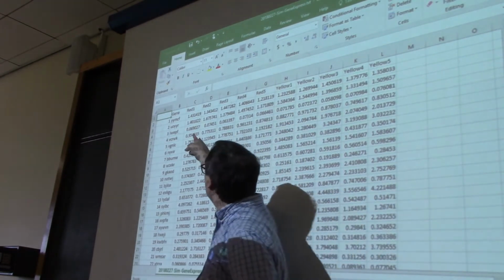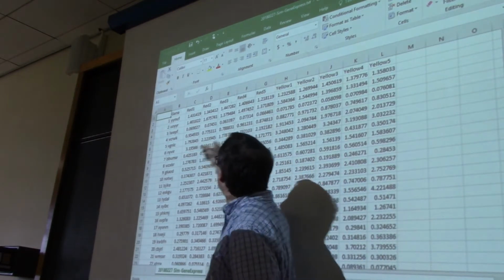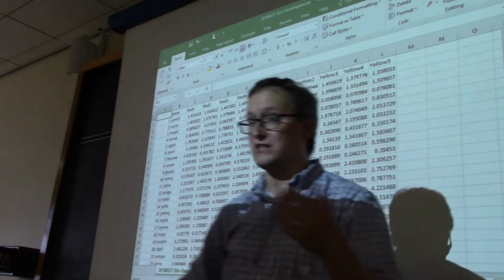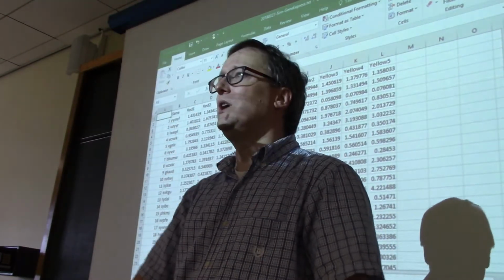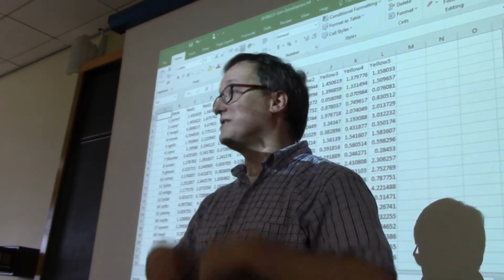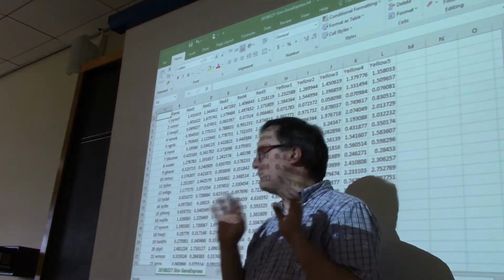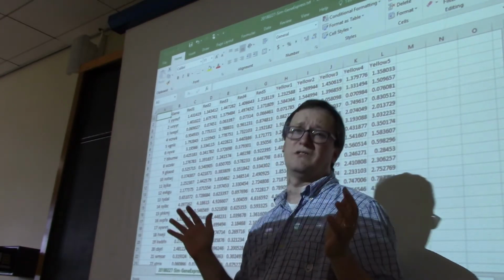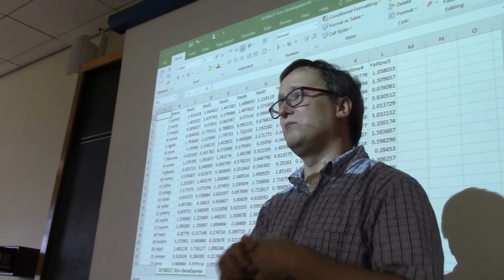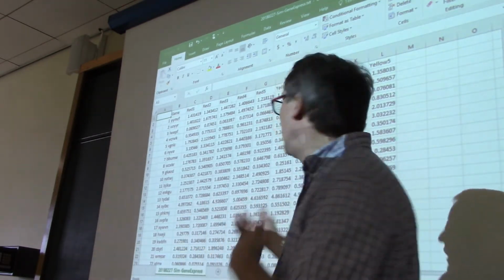All right, now I've included red 1, 2, 3, 4, and 5, columns C through G. And I've got yellow 1, 2, 3, 4, and 5 in the next 5 columns. So in each case, the data for each gene is simulated, and we've got 5 values. Think of this as 5 replicates in each of 2 cohorts. So this is one of the simpler kinds of models for us to work with. Data that are continuously distributed, 5 replicates each, and so on.